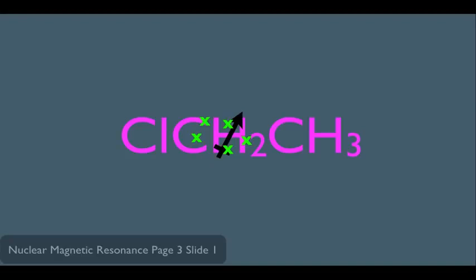However, remember the principle here. This chlorine is very electronegative. And remember, that means that he attracts electrons. So he in turn would have an influence on the electrons surrounding that H atom. He would pull the electrons this way. What that would effectively do here is make this hydrogen very de-shielded. He simply has no electrons around him, or very few.